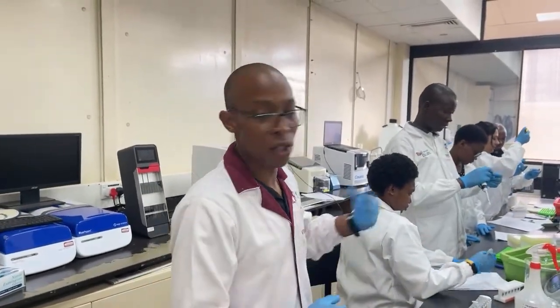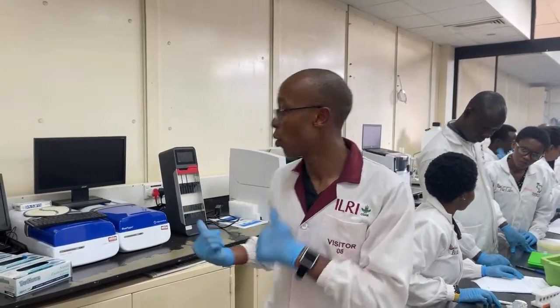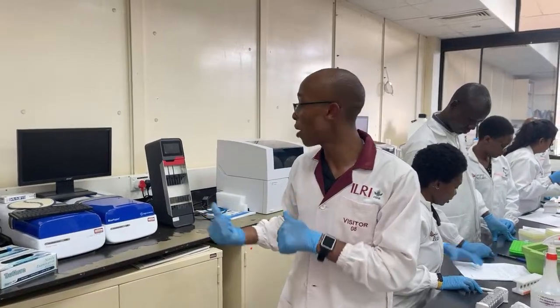Okay, this is the end of the first day of practicals. The group has just eluted what we're hoping is high molecular weight DNA. It's kind of viscous now, so we're going to let it rest overnight so that it's solubilized in the solution. When we come back tomorrow, we're going to do QC, meaning the TapeStation as well as the Qubit, and then assess the quality of our extraction. If everything is good, we're going to do the shearing on the Megaruptor, and then the PacBio molecular library tomorrow. So thanks for staying with us. See you again tomorrow.